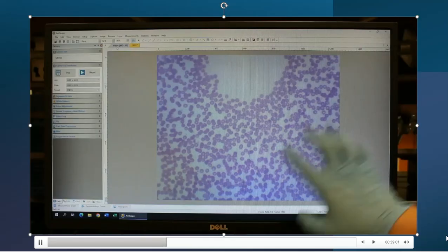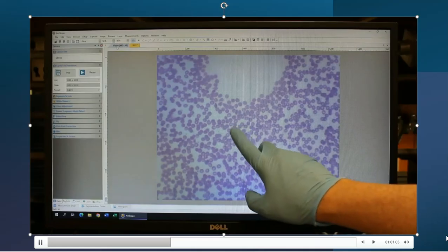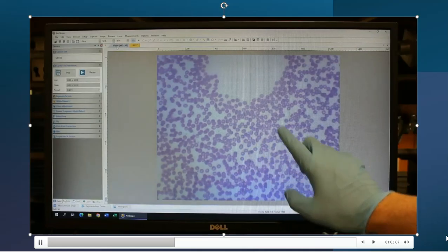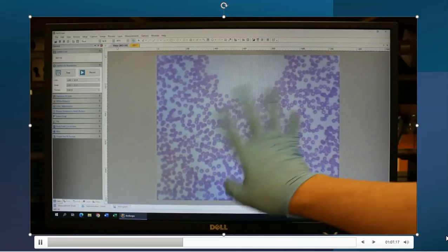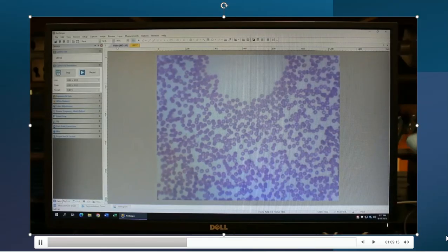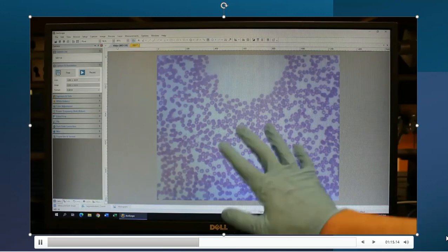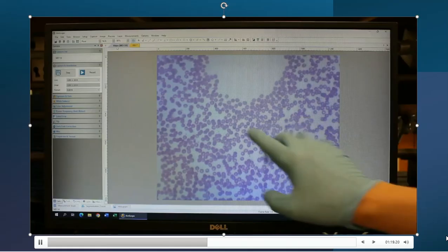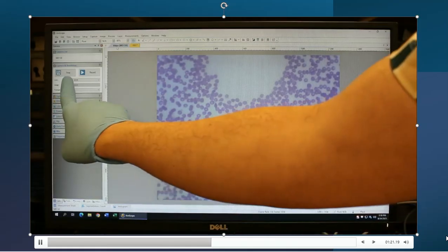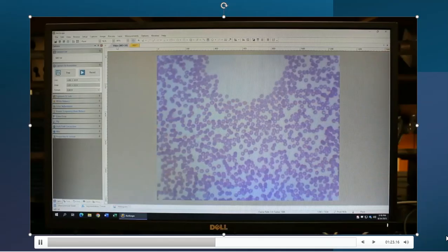All right, so here's the screen, and again, I'm seeing a closer view of all of these little round circles, and those little round circles are maybe blood cells. They could be from a human, or they might be from another source. We just don't know, but we're making these judgment calls and kind of helping figure that out. Again, I need to take a picture of this slide as well to prove that I did it. So once more, over on the left-hand side of the screen, you're going to see the word snap. So I'm going to snap there, and crackle and pop.